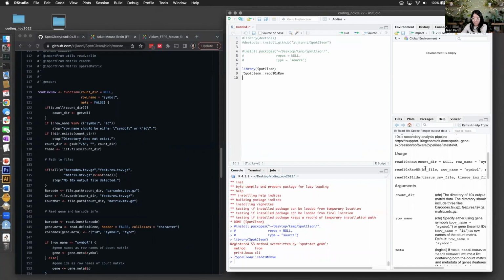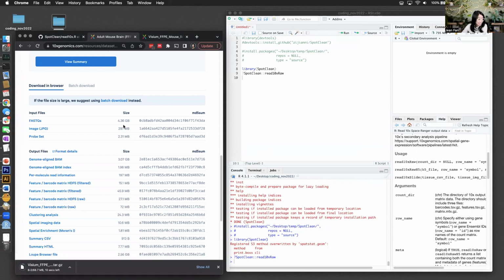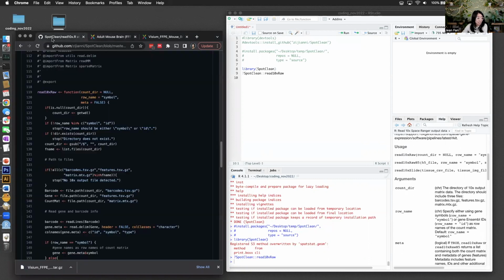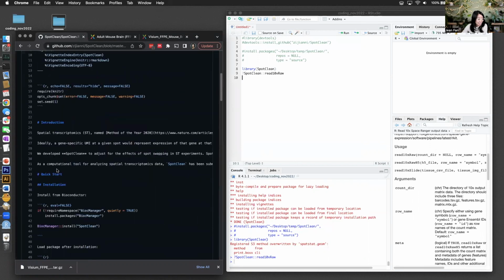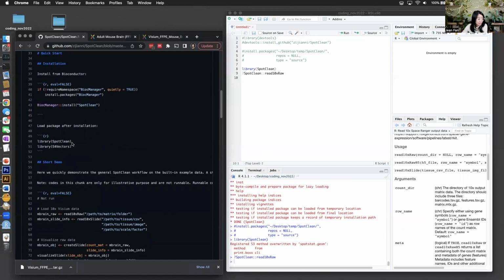Great, perfect. Okay, there is an H5 format. I can download either. I'm just going to download the raw. So I need the raw, and let's see, is there anything else? Let's go back to the vignette code. I don't want to build the whole vignette, so I'm just going to read it. And okay, I'm going to copy some of their code.